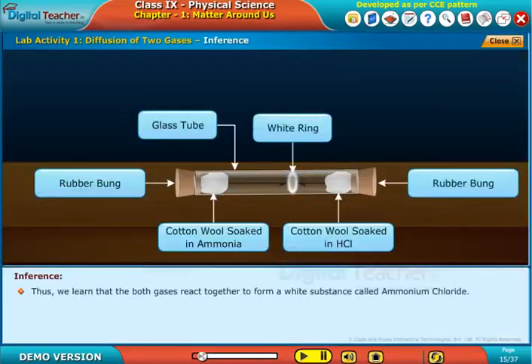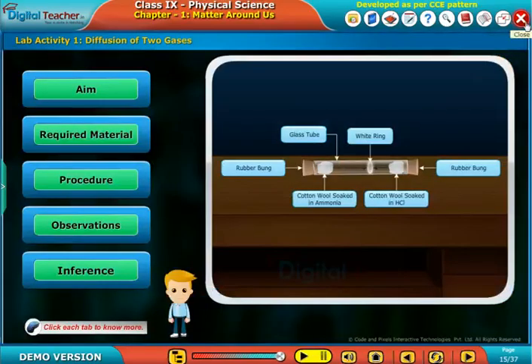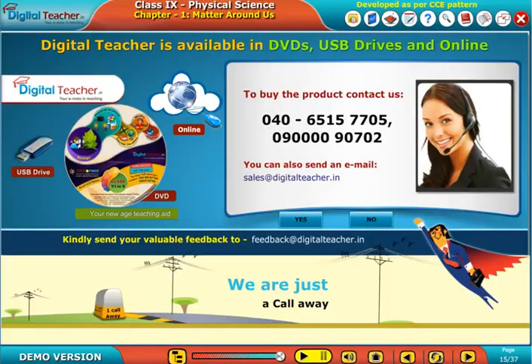Thus we learn that both gases react together to form a white substance called ammonium chloride. Therefore, we can conclude that HCl is more dense than NH3, because NH3 travels a farther distance than the HCl in the same period of time.